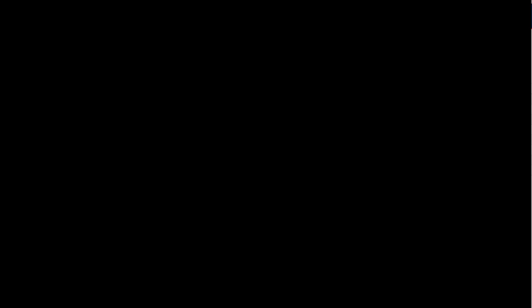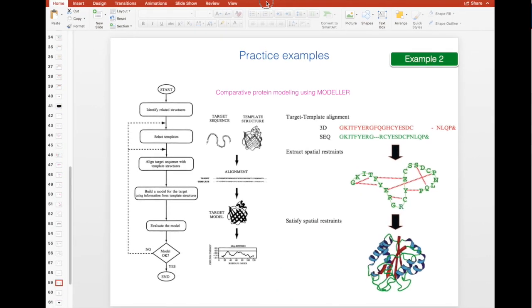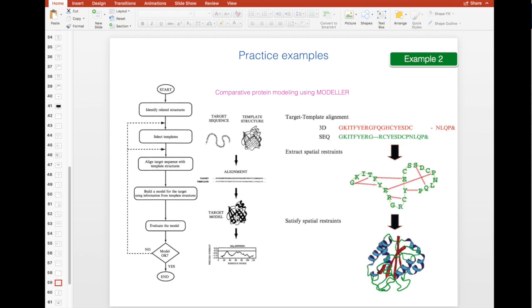The process looks like this. You have your target sequence. Then we are searching for the structural templates. We perform the alignment between the target and the template and Modeller will take care of the model generation.